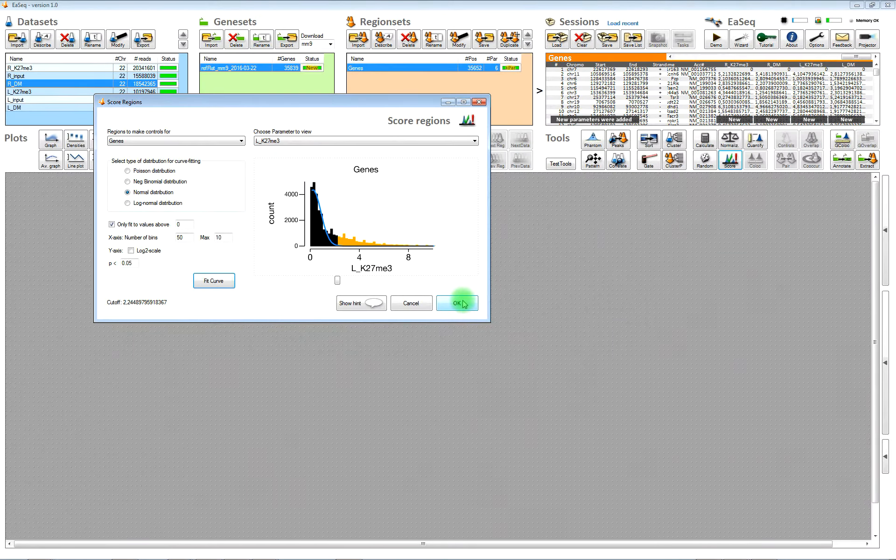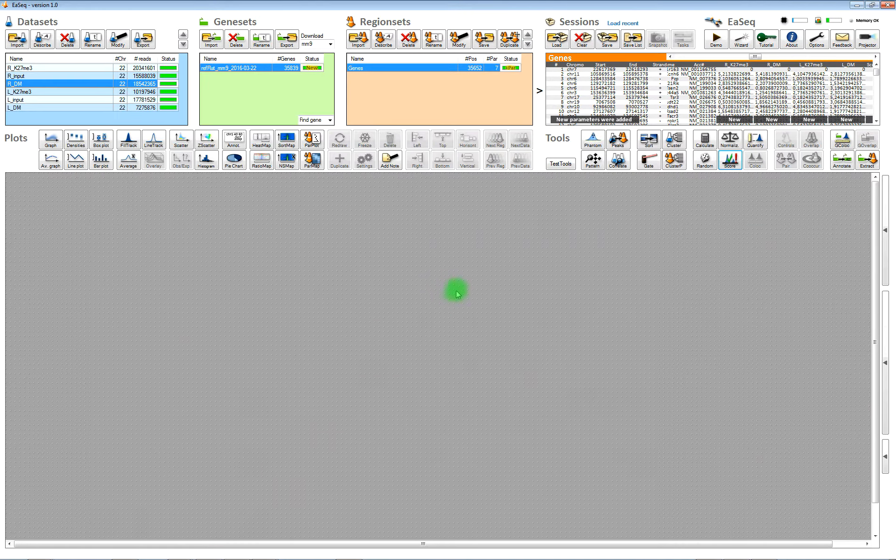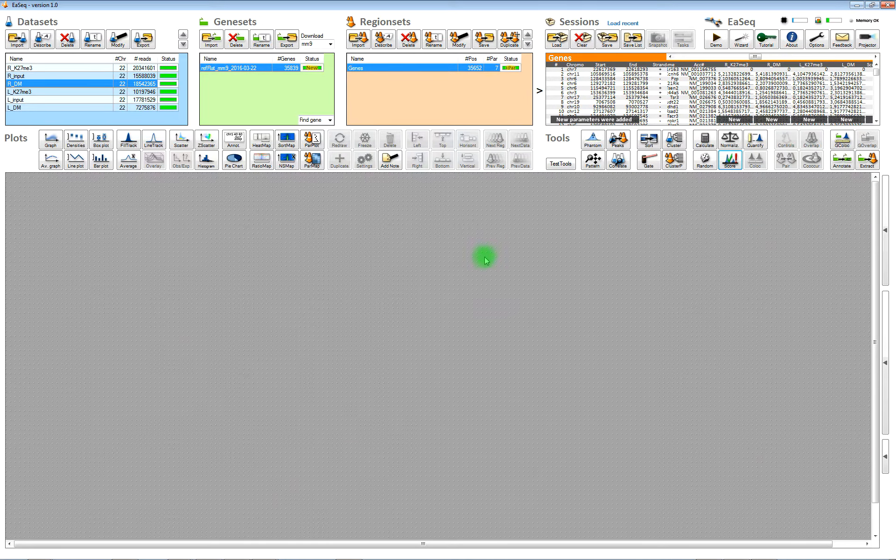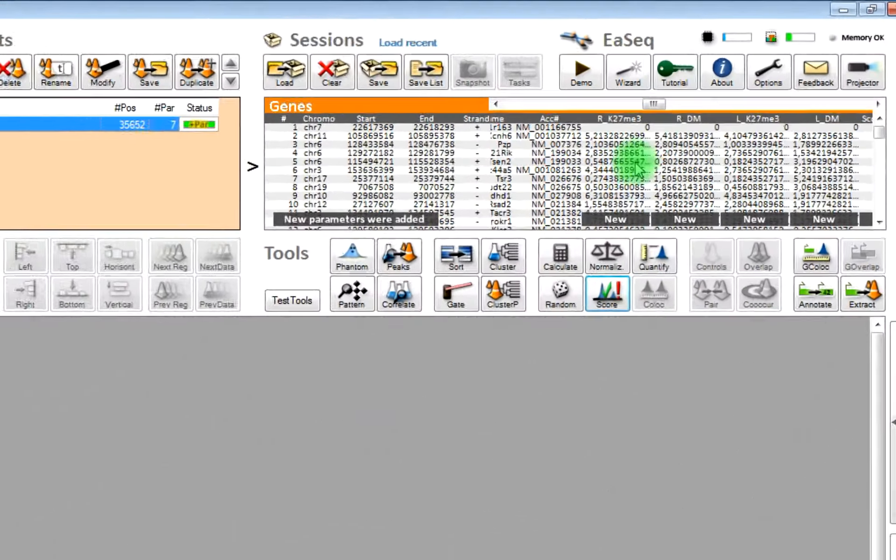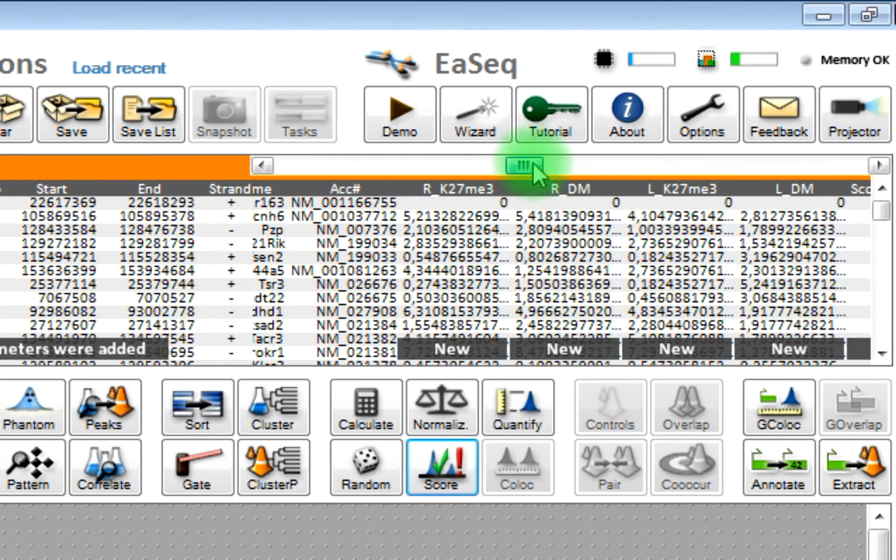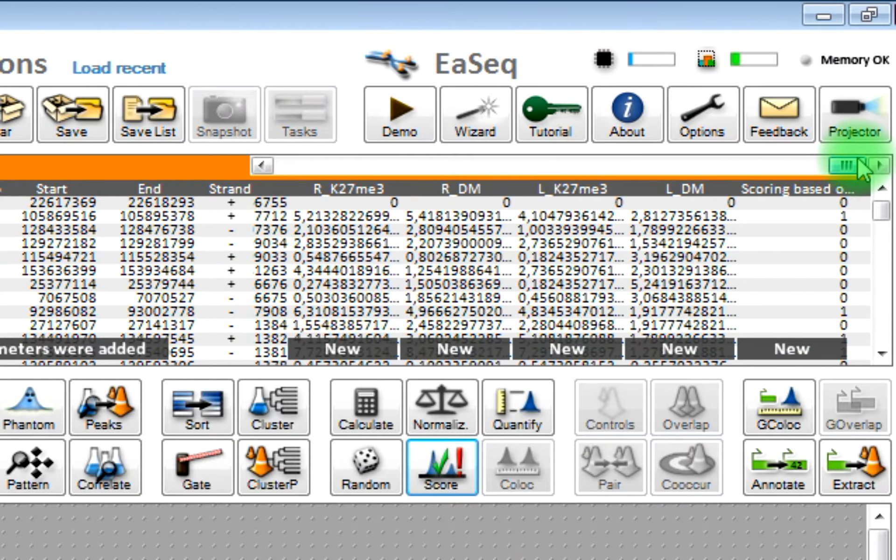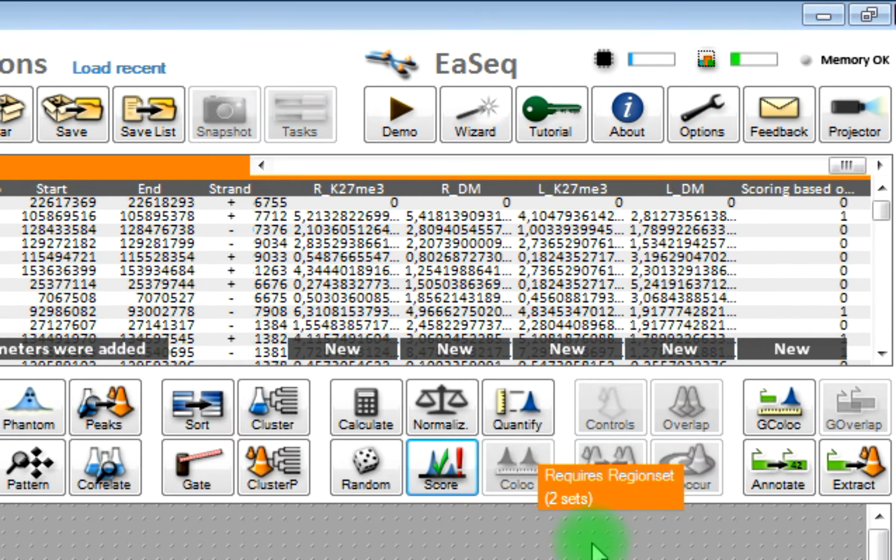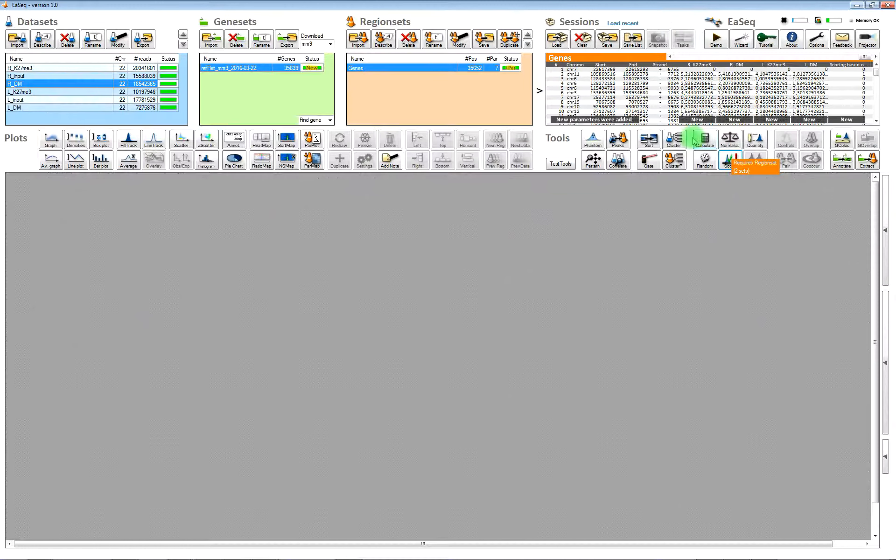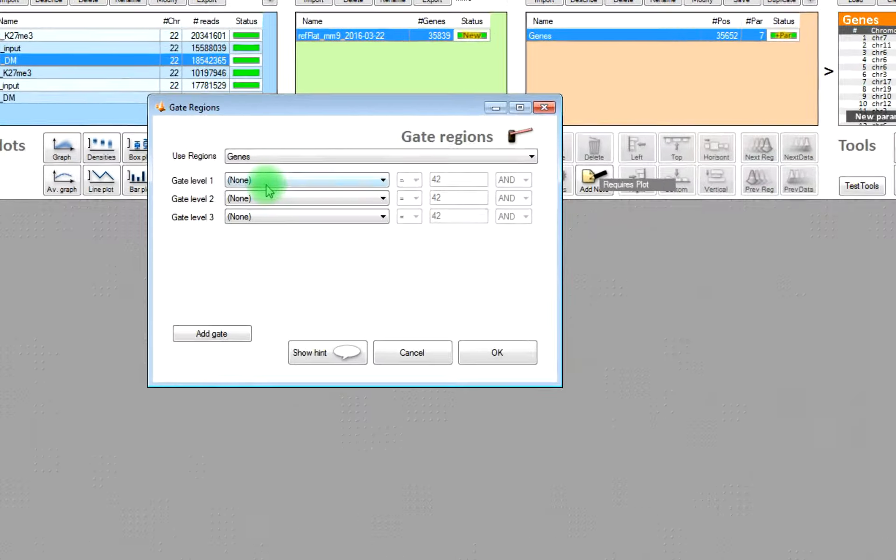We do some curve fitting, and then we have a new column added which contains zeros or ones depending on whether it passes the threshold or not.